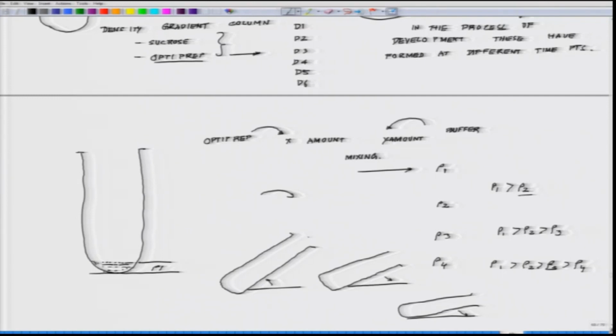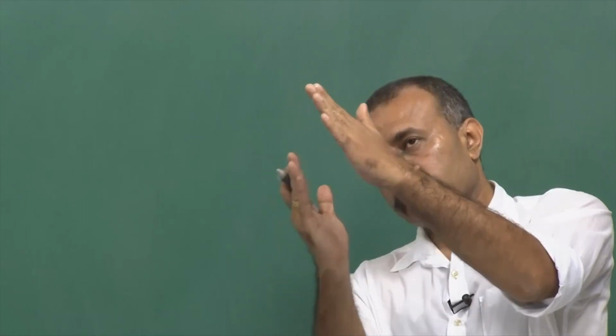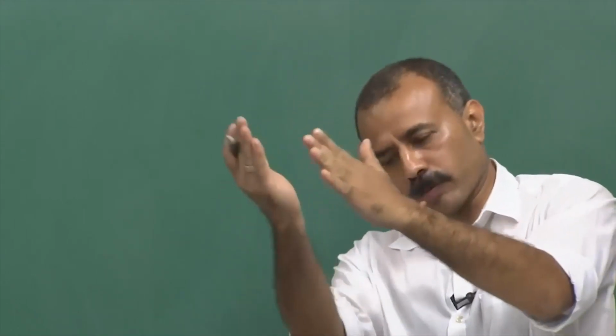And using a very narrow bore pipette here, you very gently allow the stuff to form that layer, something like this. So, this is where your pipette tip is. You can further go down if you have that margin, and slowly you layer it. What you achieve is layer 1, and you always have to keep it tilted, slowly allow it to settle down, then put the next layer.